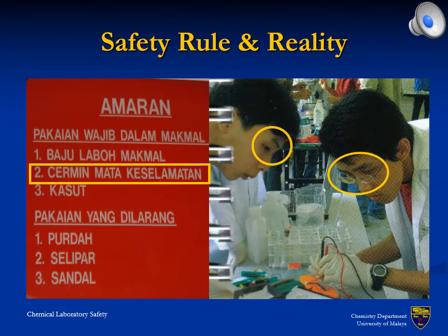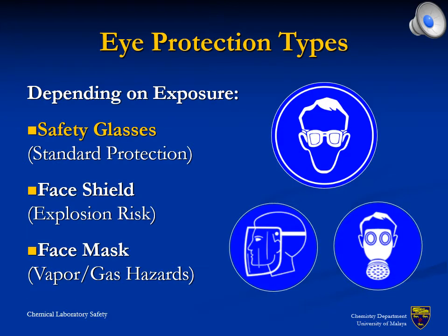Eye protection is most crucial inside a chemical laboratory, because of the short time window for first aid measures and the obstacles for an effective rinsing of eyes. While regulations worldwide are clear, their implementation is insufficient, as documented even in corporate videos. Different eye protection may apply inside a chemical laboratory.